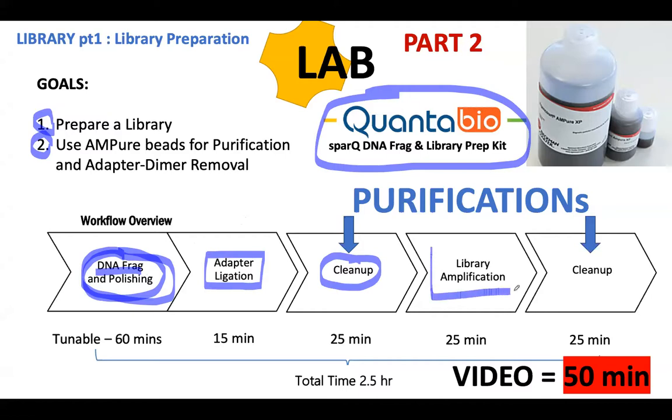After that, we're going to perform PCR, and then a final cleanup again. So you're going to see the AMPure beads purification twice with different settings, and all the other reactions are basically just enzymatic reactions, so they're very easy to understand.